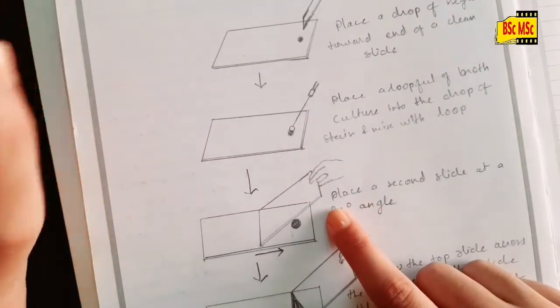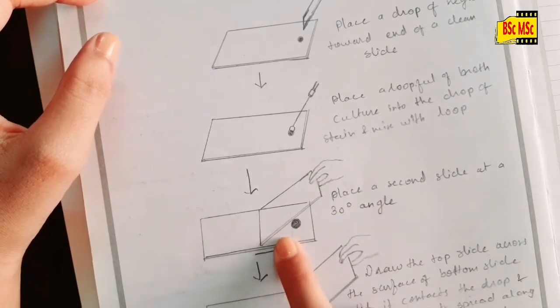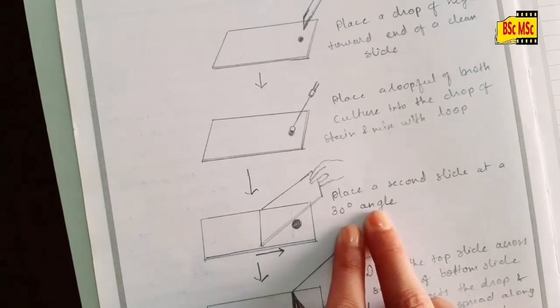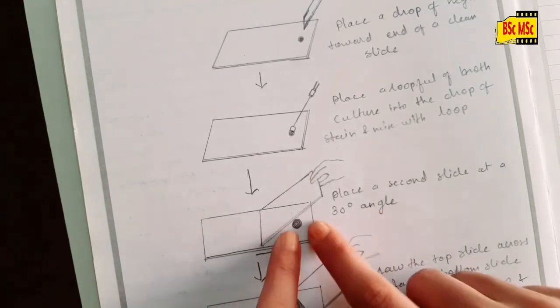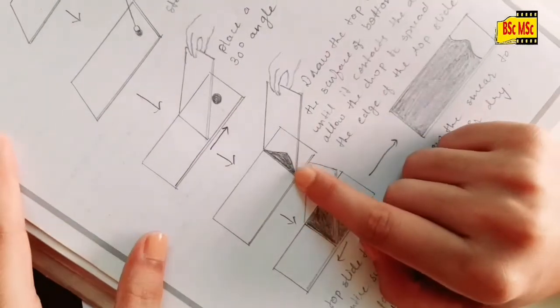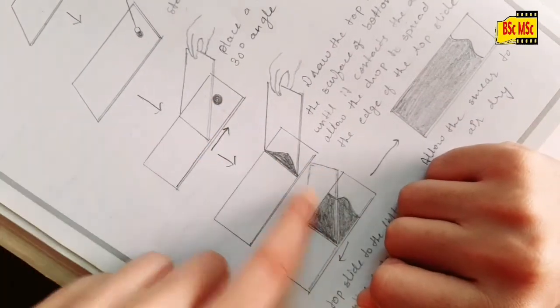Then, take another clean slide and place it like this. See, this image is showing placing it at 30-degree angle near the drop. In the second picture you'll be able to see - like this. When you place it near the drop, the drop instantly spreads.